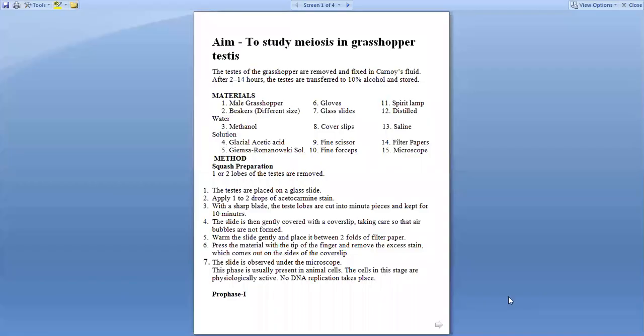The testes of grasshopper are removed and they are fixed in fixative fluid. After 2 to 14 hours, the testes are transferred to 10% alcohol and stored.